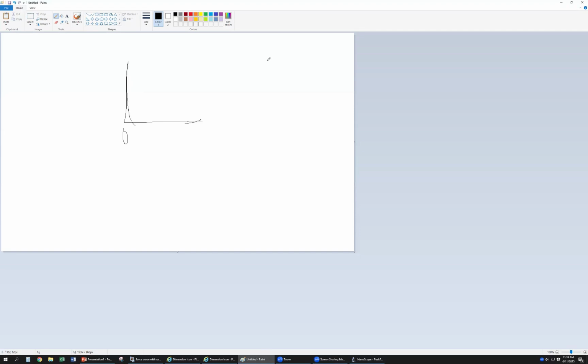And also if your calibration is wrong, for example, the deflection sensitivity is too high, then you may get like this. That means the indentation depth is negative. Indentation depth never should be negative, right? That means you get the wrong calibration.